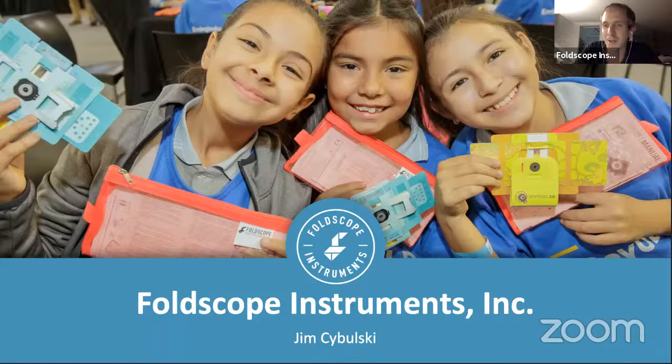So my journey with Foldscope started in 2012 when I started working with Manu Prakash at Stanford University. At that time, we really wanted to come up with a device which would have a global impact and would allow us to achieve microscopy at a cost of $1 per unit. During my PhD work there, we spent a lot of time thinking about solutions for that, as well as other frugal innovations. I traveled around the world quite a bit, exploring applications of the Foldscope and the success of our different innovations. So I'll just share some of the outcomes of all that work with you today. It's just a brief intro.